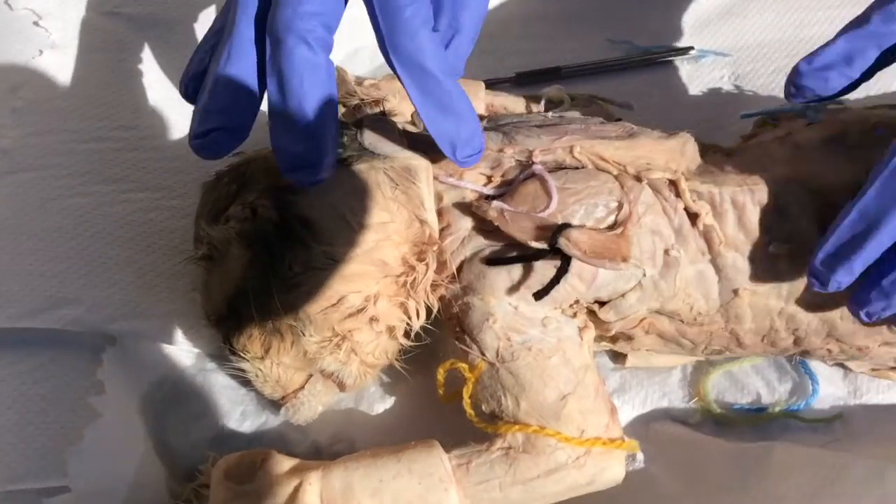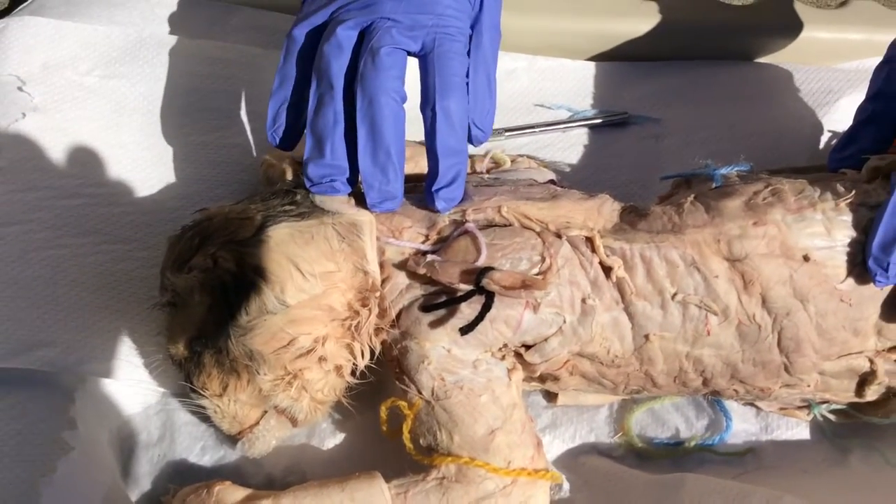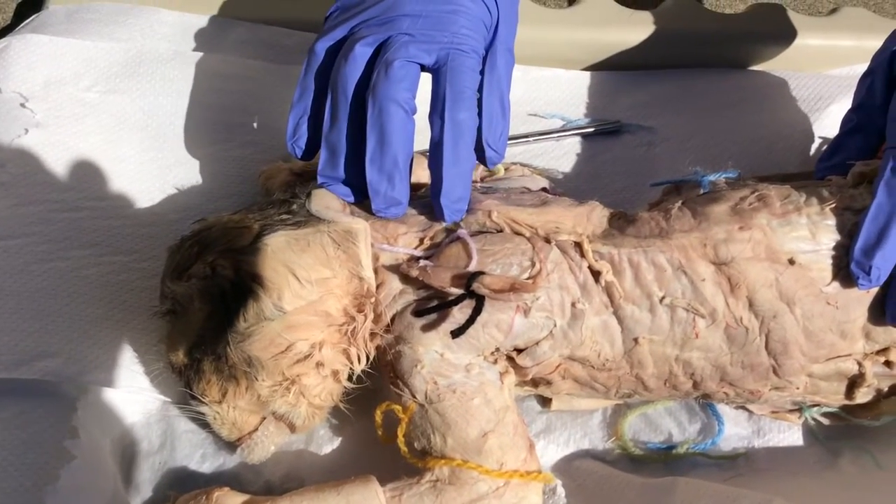The rhomboid muscle is directly in the middle in pink. The rhomboid moves the scapula and is a deep, most medial muscle in the upper back.